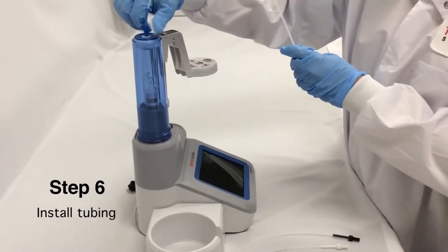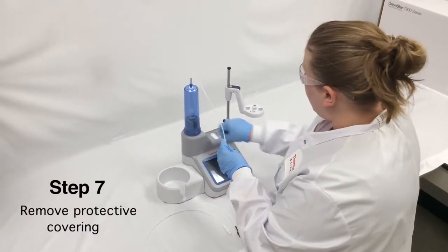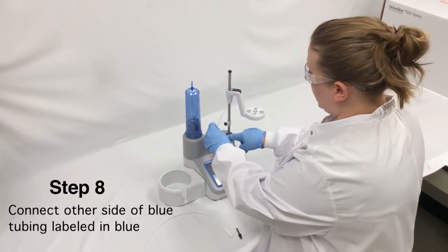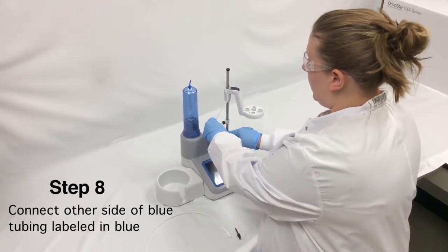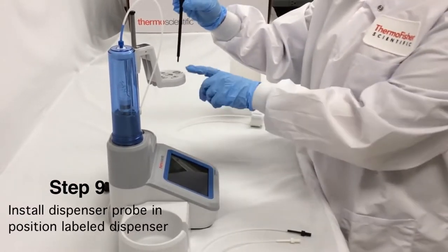Next, I'm going to install tubing. I'll remove the protective covers that prevent dust from getting into the valve, and connect the other side of the blue tubing to the burette, labeled in blue. Next, I'm going to install my dispenser probe.